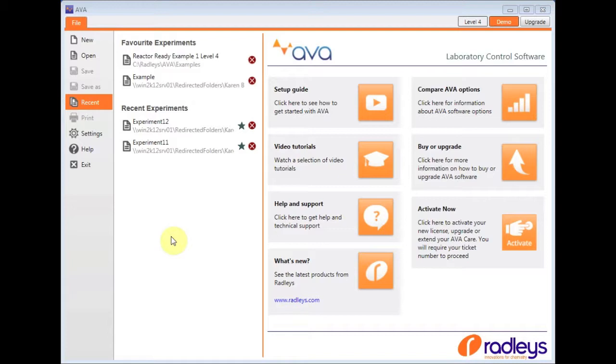The recent experiments are listed on the left-hand side. To make them always appear in your favorites, simply click on the star next to the experiment name.